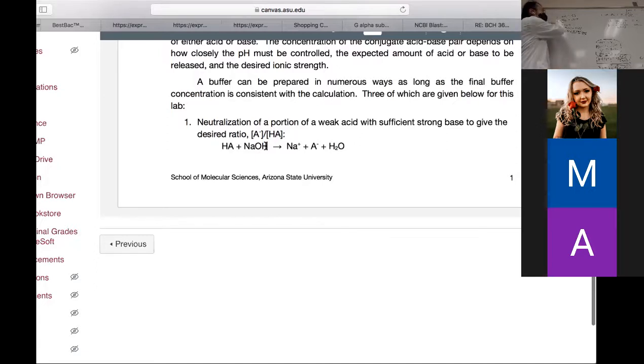By knowing the molecular weight, you can calculate the mass, which equals n times molecular weight, which is somewhere on the whiteboard over here. By knowing n and the molecular weight, you can calculate the mass you need. It's some grams over here.